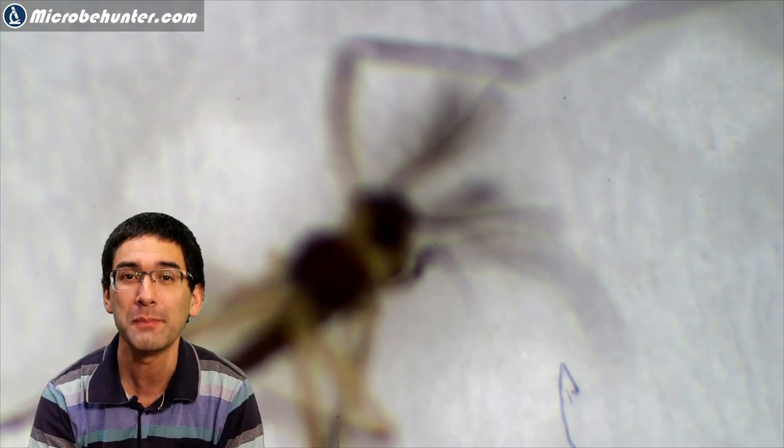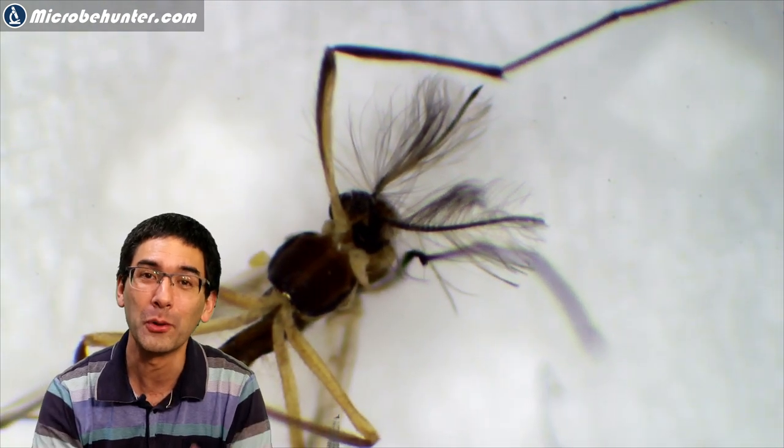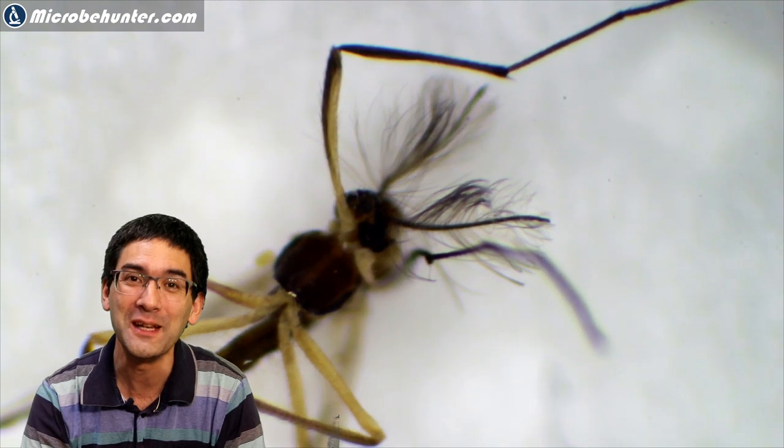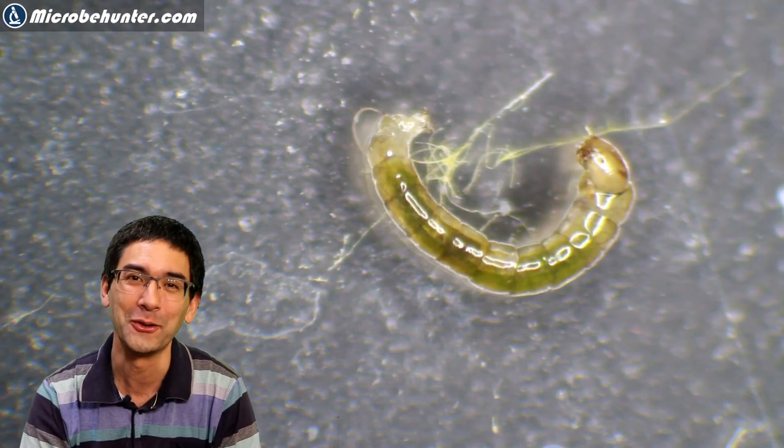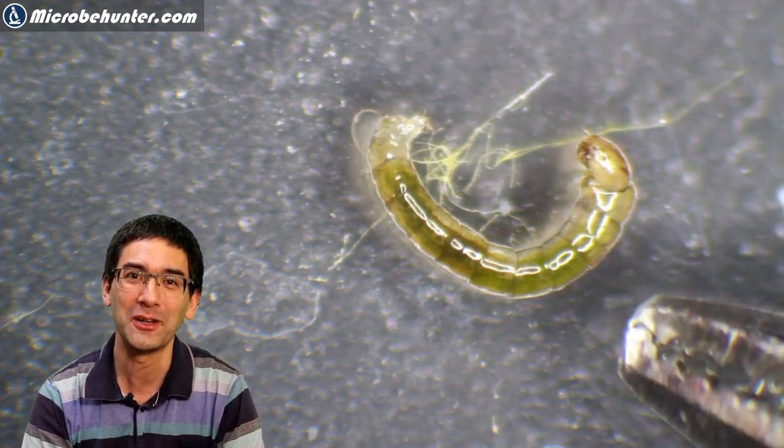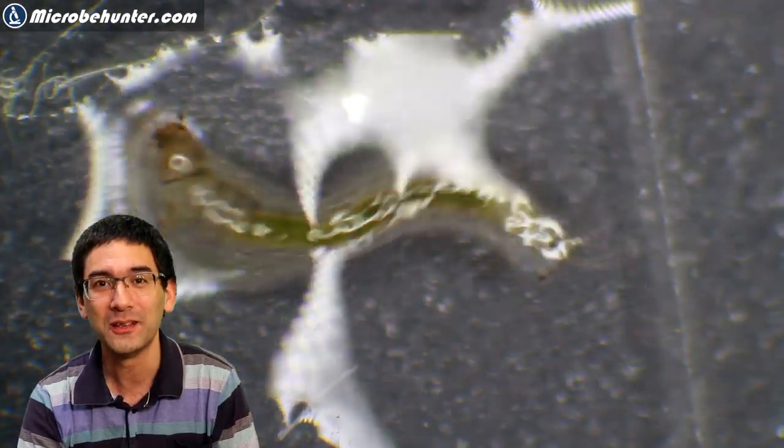One of the things you could do is make a permanent mount of it to preserve the insect for future generations. Of course, I'm not going to do that—I'm just going to look at it under my stereo microscope.